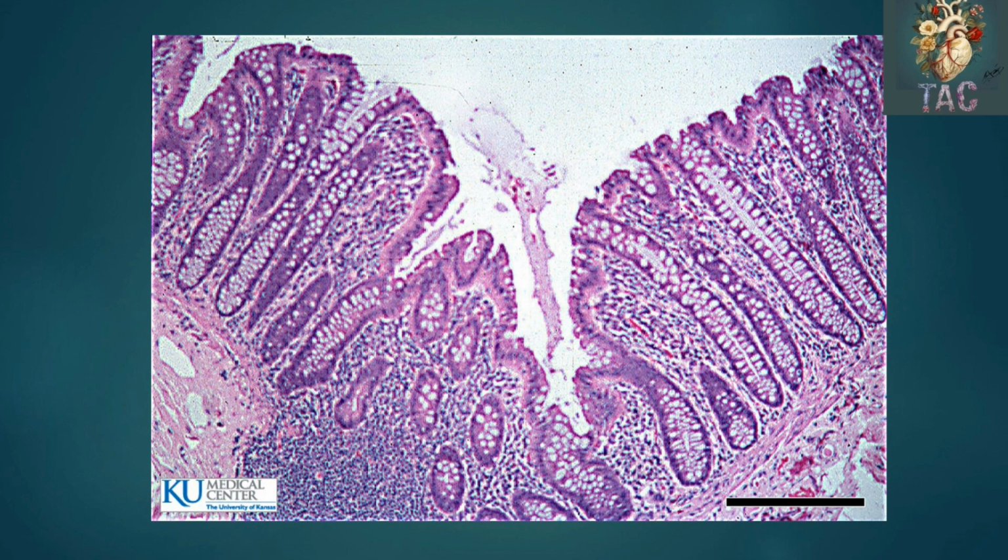So this is the histological section, H&E stain, of the mucosa of the large intestine. Here you can see the straight surface. There are no villi present over here, neither are plica circularis formed. The epithelium is simple columnar with a large number of goblet cells. These are the deep, straight tubular intestinal glands. In between the glands you can see lamina propria with high cellularity, and then the muscularis mucosae is present over here. Here you can see a lymphatic nodule is also present.